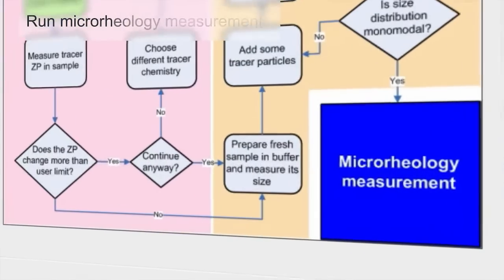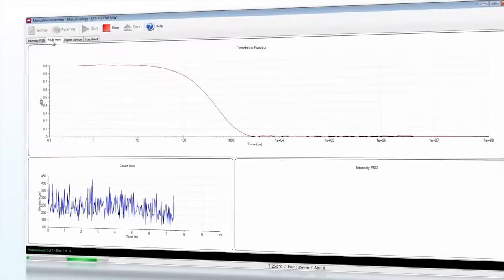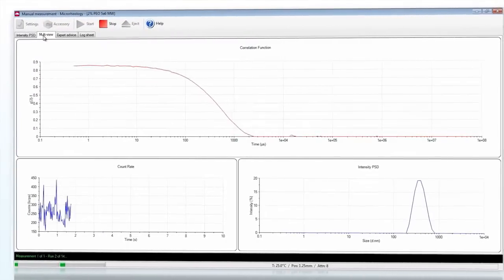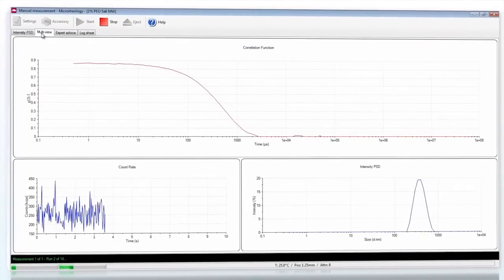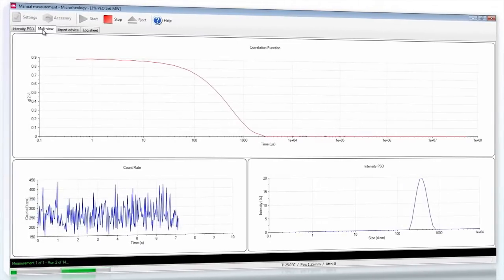Following optimization of the tracer particles used the microrheology measurement is run. Once a particular sample has been evaluated for a suitable tracer particle type, size and concentration then only the microrheology measurement step needs to be run to extract rheology data for subsequent tests.